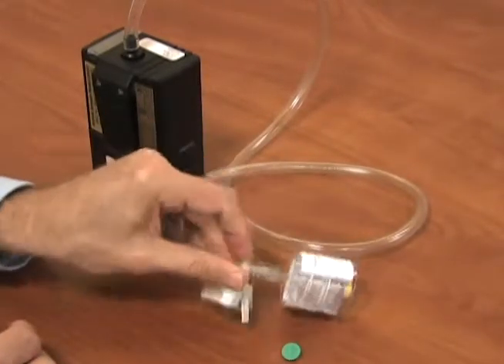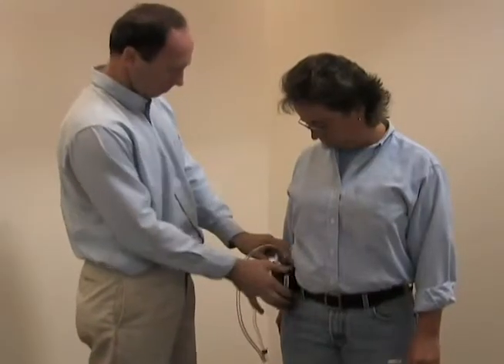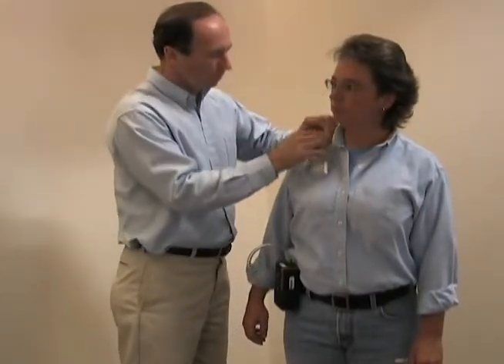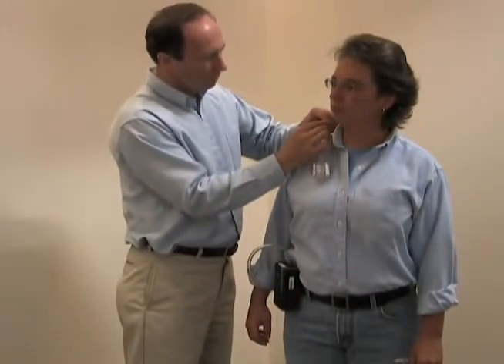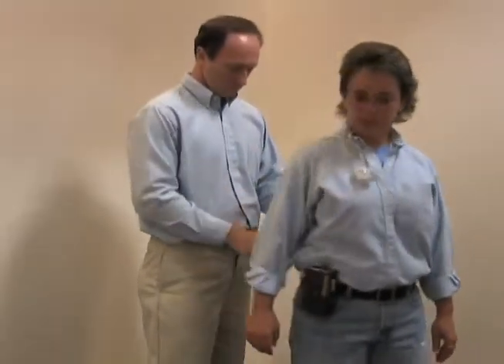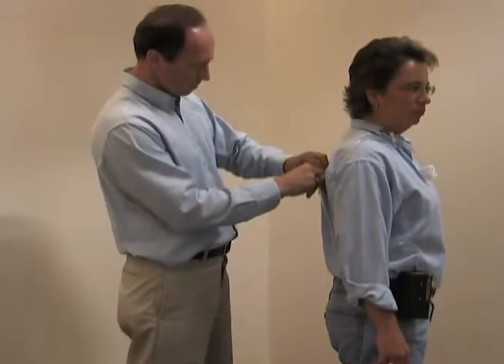Recommended sampling time is 15 minutes at 1.0 liters per minute. Attach the pump to the worker's belt or pocket, either in back or on the side. Bring the tubing around to the front and attach the sample to the shirt collar in the breathing zone. Use the collar clip to attach the tubing in place along the shirt to restrict its movement.